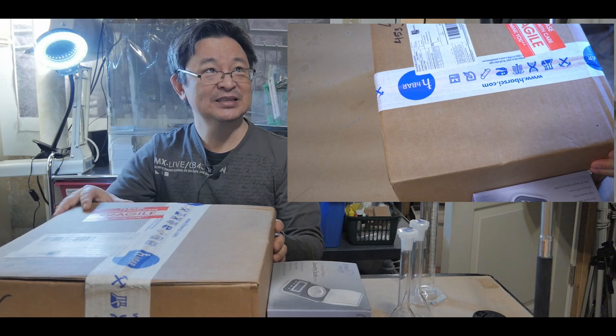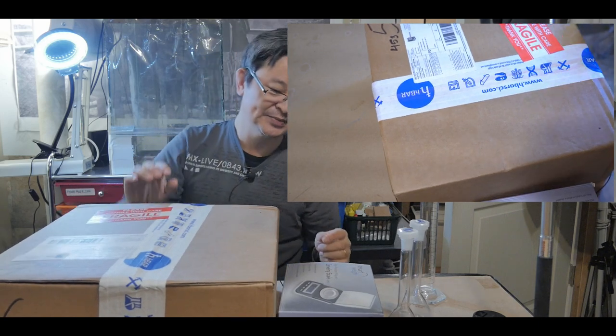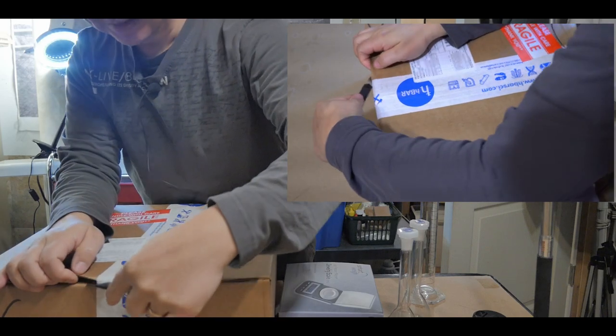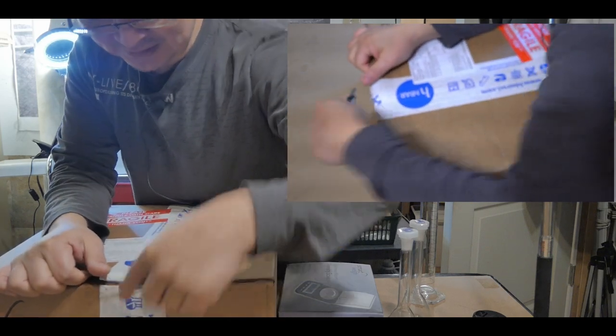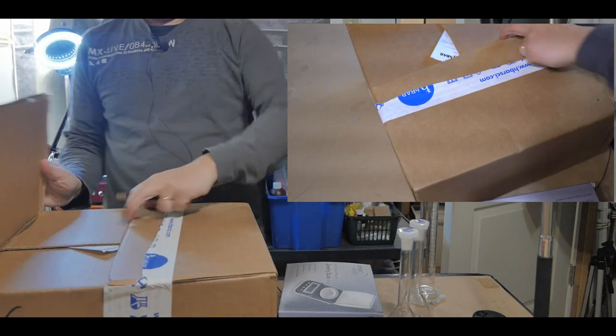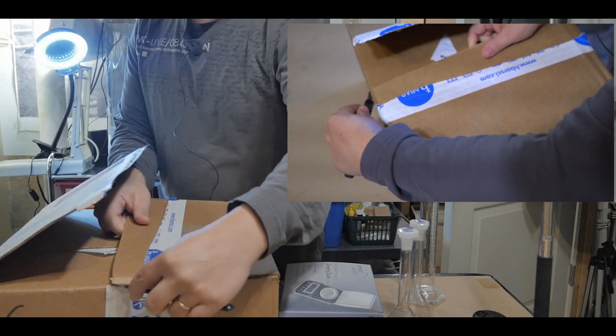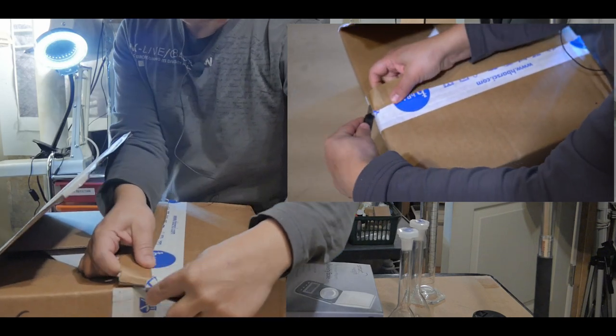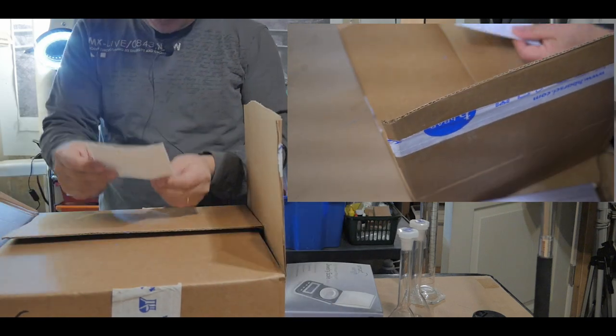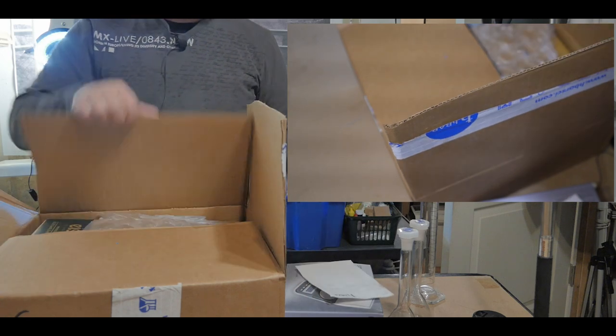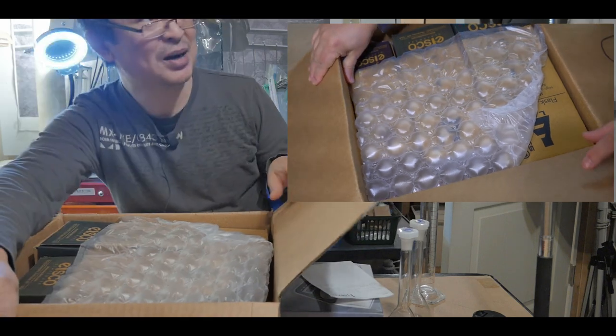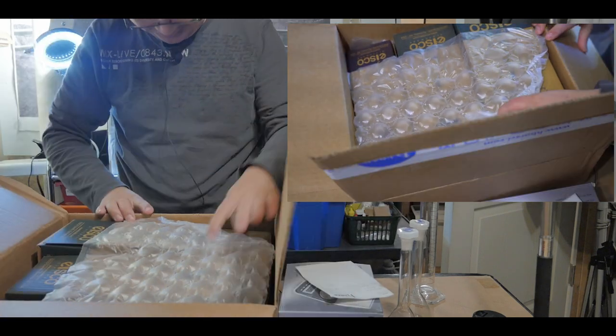Okay, so here it is, this is the box. Let's open up what is in here and I'll show you. I bought more of it, of course. It took longer than I expected - usually arrives within a week, now it took about two weeks to get. And they're okay, good. They gave me a receipt for that one. Let's see what we have. Wow, nicely boxed. Look at that, it comes with bubble wrap.